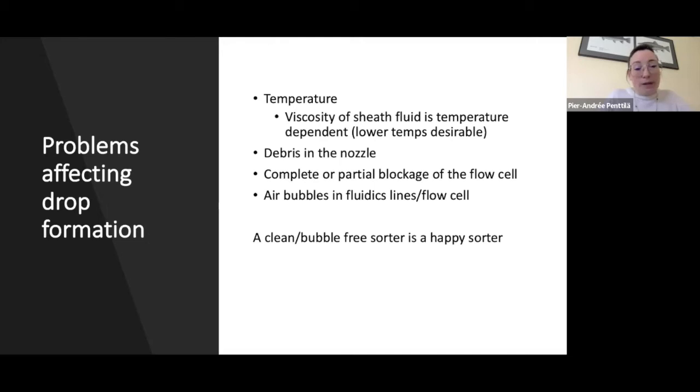So in flow cytometry facilities, we spend a lot of time making sure that the system is free of air and free of any debris, either in the nozzle or in the lines itself.